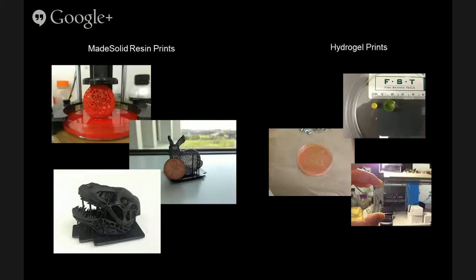I noticed that the SLA scene that you just showed does not show a scaffold. Does that method have scaffold? I was surprised. I thought the powder method was the only method that did not require scaffold. It depends. If you have a structure, well, we're looking at it upside down, and if you end up with parts that are just totally floating in space, that don't have anything that they're attached to, then you're going to have issues there.